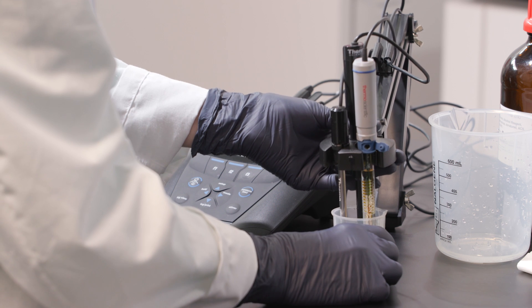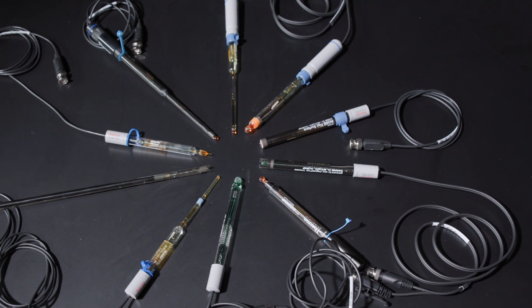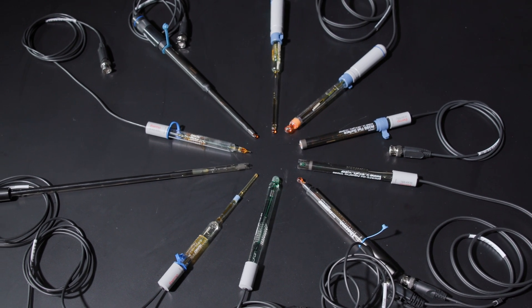The electrode is essential because it controls the precision and reproducibility of your results. Choosing the correct electrode is key to an accurate pH measurement, so let's see why. Because there are so many options, it's often hard to know which pH electrode is right for your application.